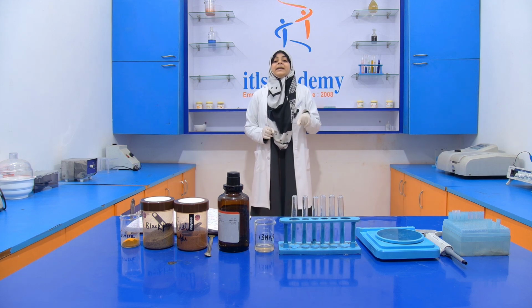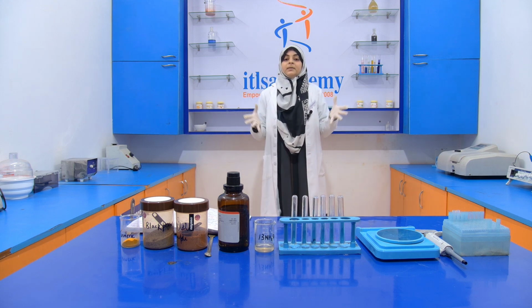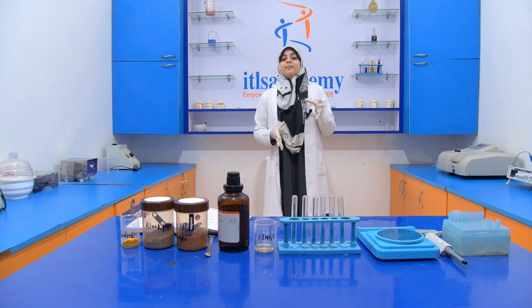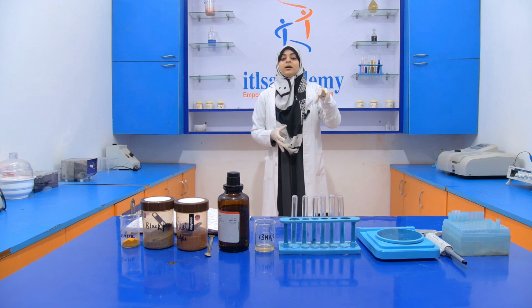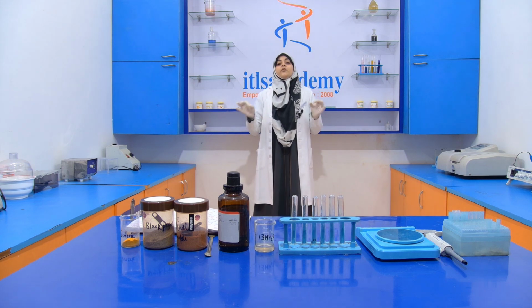But in case of artificial color, it is decided by the FSSAI how much amount of that particular color can be added into that particular food product.